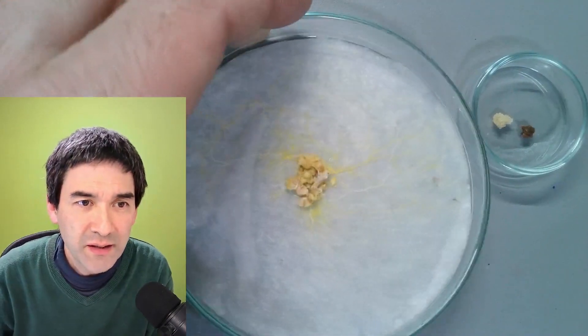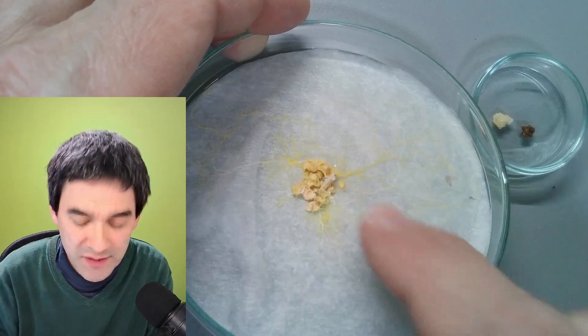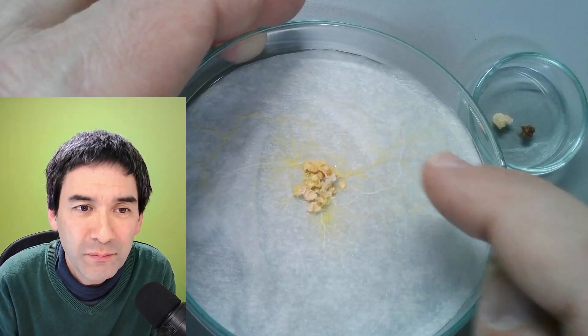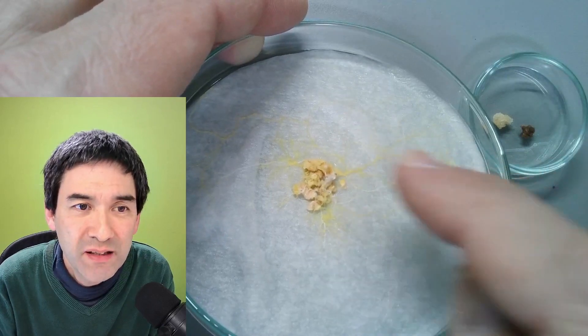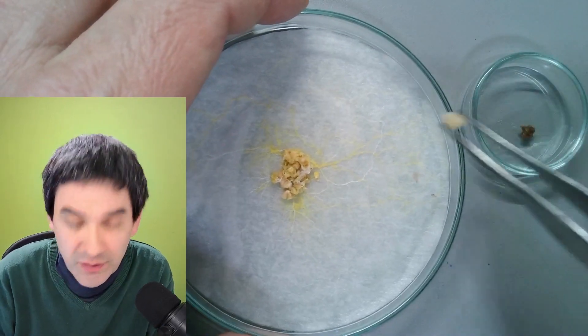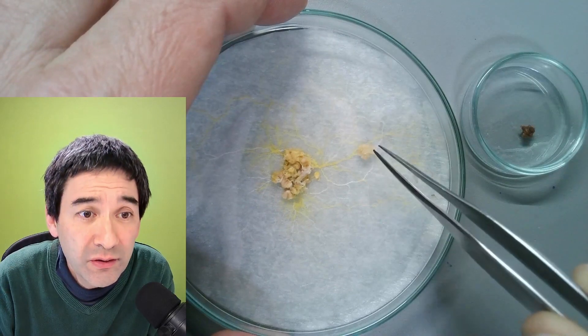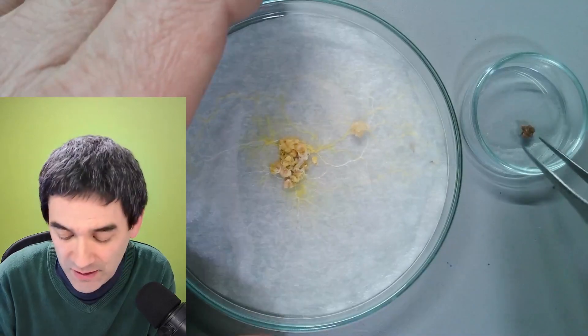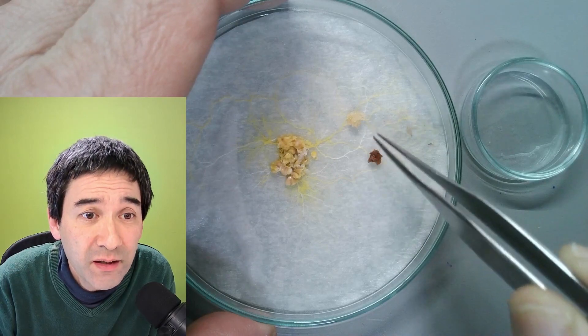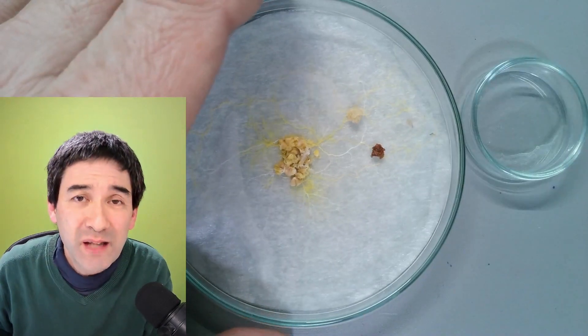So that's a slime mold. You can see there are some cereals in the center and those are yellow, thin branches that you see here. That's basically the slime mold. Let's put first the white cookie here and also the chocolate cookie over here. Then let's see which one of those two the slime mold likes to eat most.